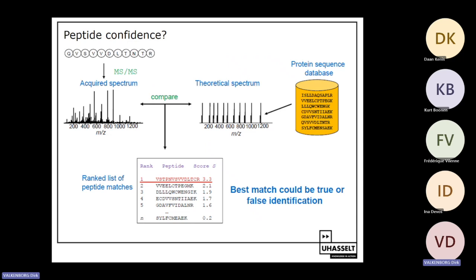We do tandem MS on this peptide, and we get an amino acid ladder or fragmentation pattern, because we have not only one such peptide, we have several copies of this peptide, and the propensity to break is, well, a stochastic process. So once in a while, this peptide will break in two parts at different cuts, and as such, we will see a peptide ladder appear, and we call that a B ion series and a Y ion series.